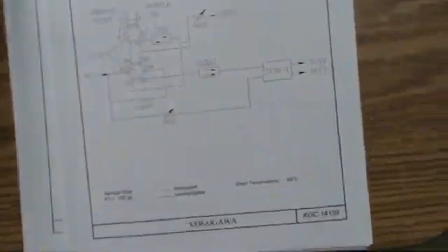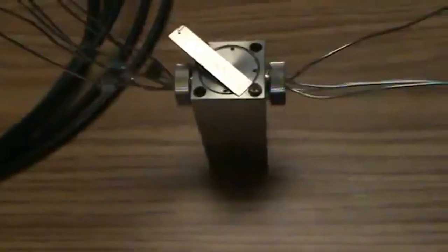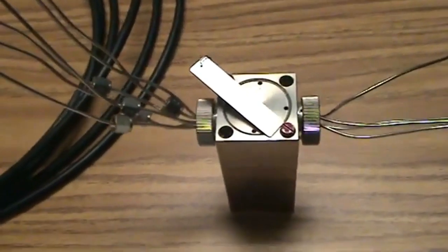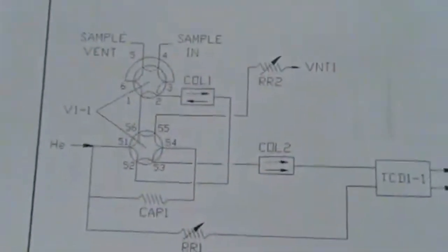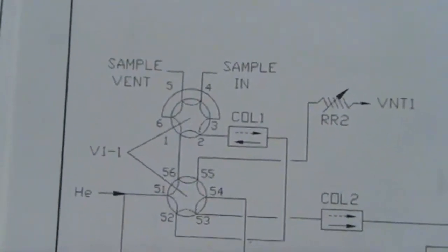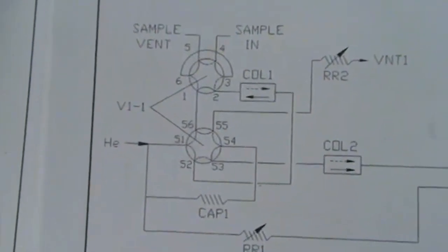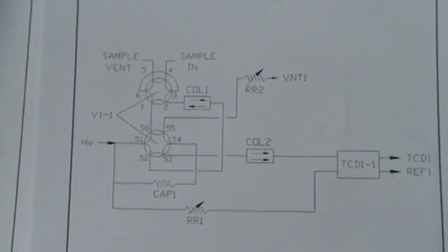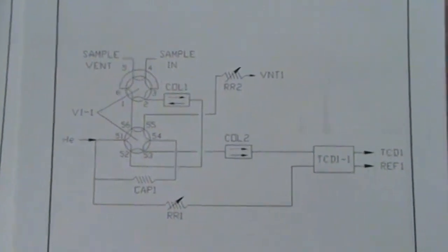Well, boys and girls, here we go. That valve is that valve. That valve is that valve. It's a dual-sided valve. One single action will do both sides. Same thing as the other stuff. Solid lines, we are in the off position. Dotted lines, on. Carrier, see it coming in on 51. I will explain all of this.